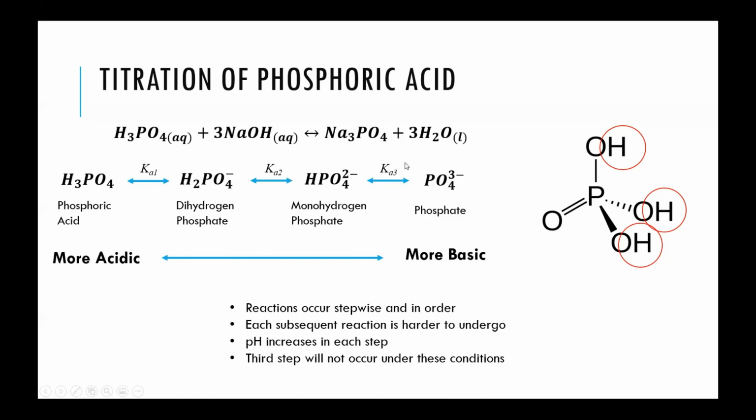But when you perform the titration and you're stepwise adding sodium hydroxide, you should be able to see these first 2 steps of the reaction and determine the equivalence point for each one of these 2 individually.